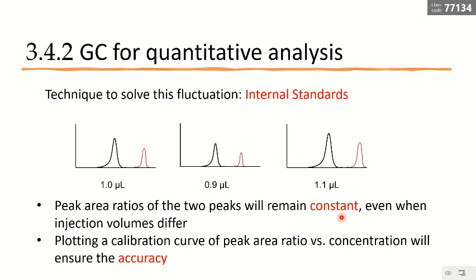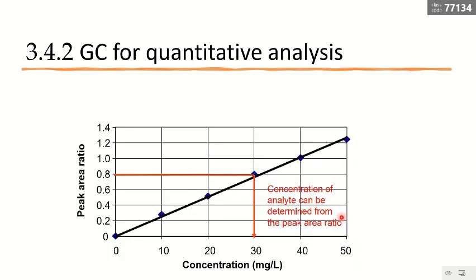Then we can use the calibration curve to get our analytical result. The meaning is, I prepare a series of samples. I know my concentrations will be 0, 10, 20, and so on. I have my 6 samples here. I can analyze my standard samples, basically my known samples. Standard sample means known sample. I made it, so I know how much I put inside.